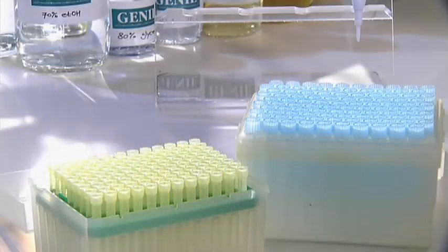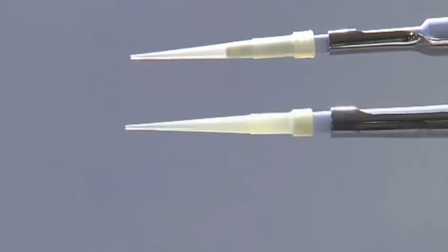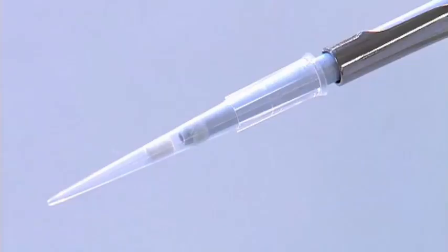Once you've set the volume you need, attach the appropriate pipette tip to the end of the pipette. P20 and P200 pipettes use the same yellow tips. P1000 pipettes use larger blue tips. Another type of tip called a filter tip is often used in the laboratory. The sterile filter within each tip can help to prevent contamination.